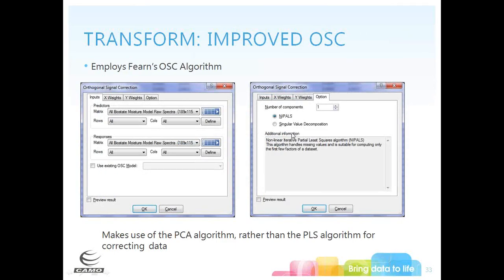Within the orthogonal signal correction (OSC), we've updated the algorithm to one developed by Professor Tom Fern in London. This now uses a PCA algorithm rather than a PLS algorithm for correcting data. If you have old models from previous versions for which you've applied an OSC, you will need to update those with the new OSC transformation.